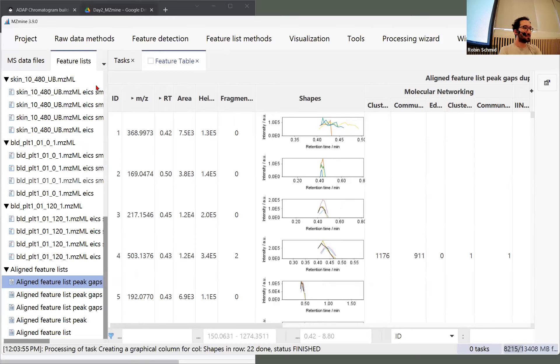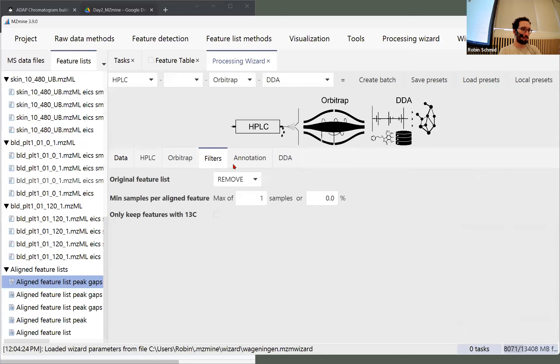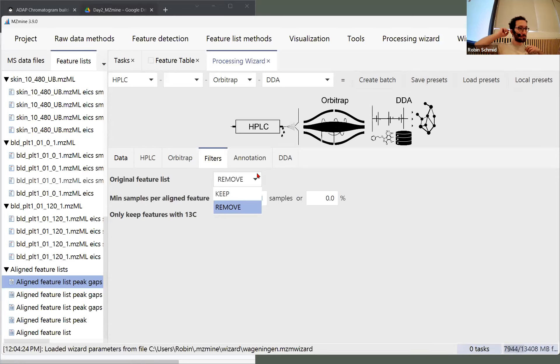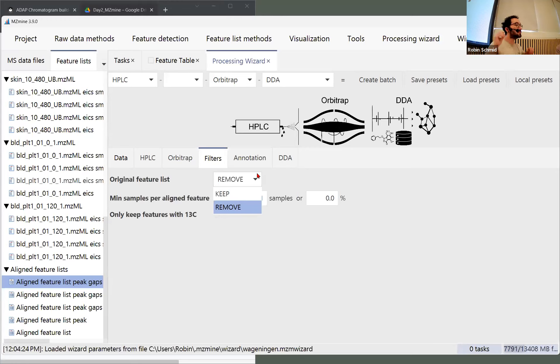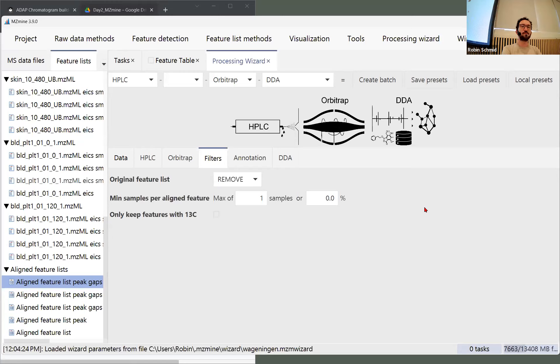Just one note: if you don't have as many items in your feature lists as expected, the reason is that during the filters it was probably set to remove intermediate feature lists. What it affects is it will remove every intermediate feature list. We first wanted to keep the intermediate results so we can see where we lost some important feature. If you had it set to remove, it's not a big problem — you can just create the batch again with that tag set to keep, or just follow along. We won't use those lists a lot.